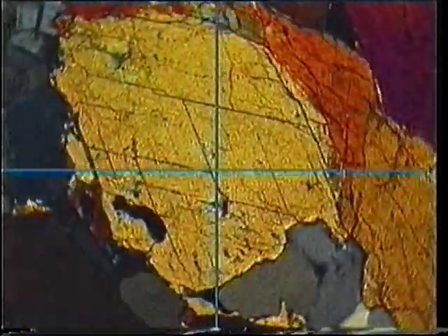The extinction of this grain is symmetrical. That is, the vibration directions bisect the angles between the cleavage traces and between the crystal faces.